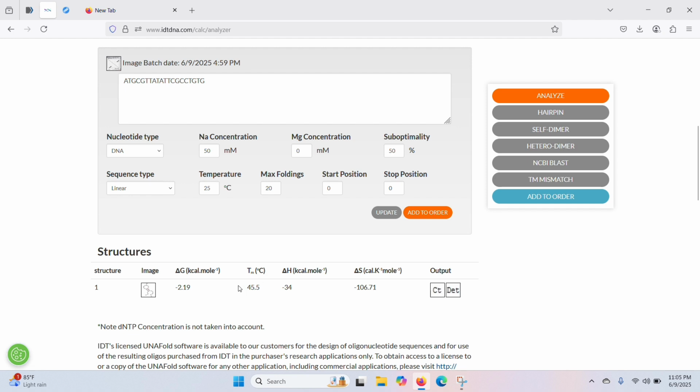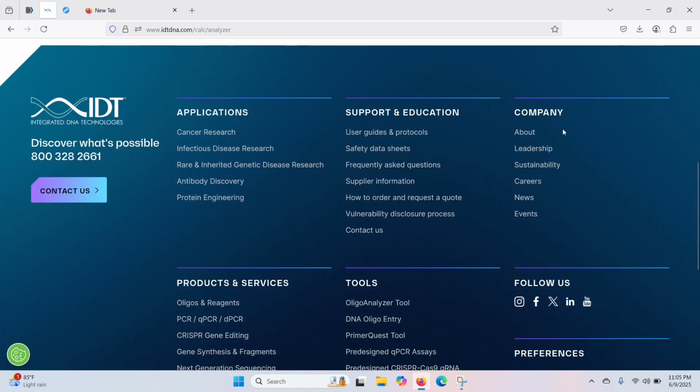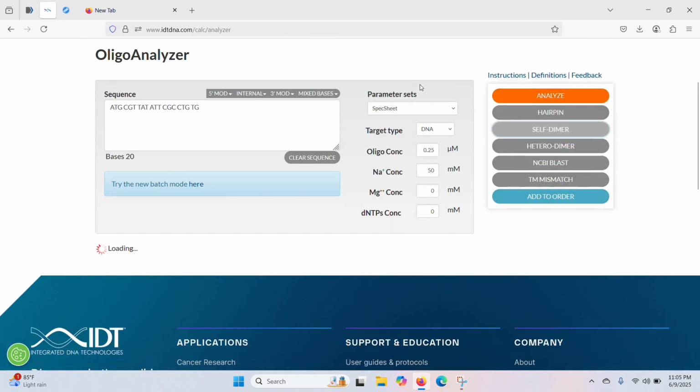It is very near to the primer melting temperature. If it is very near to the primer melting temperature, it is very likely that the primer you designed will form the hairpin. So the lower this temperature, the better the primer design. We will try to lower this temperature. Just look at the value. I will discuss it later. Then look at the self-dimer value.